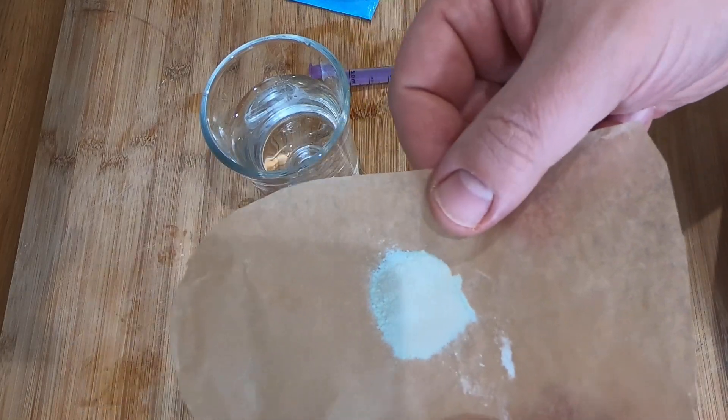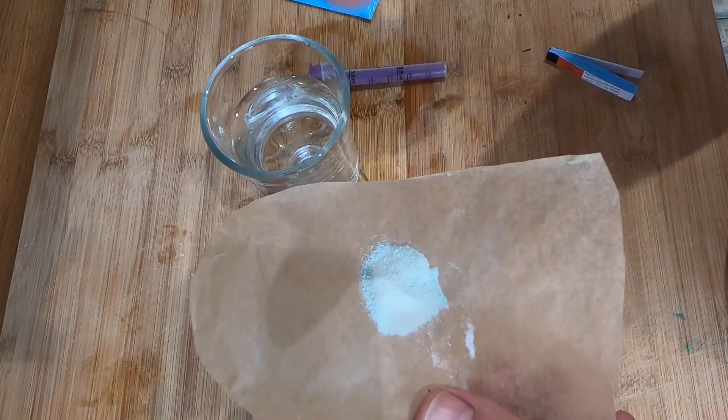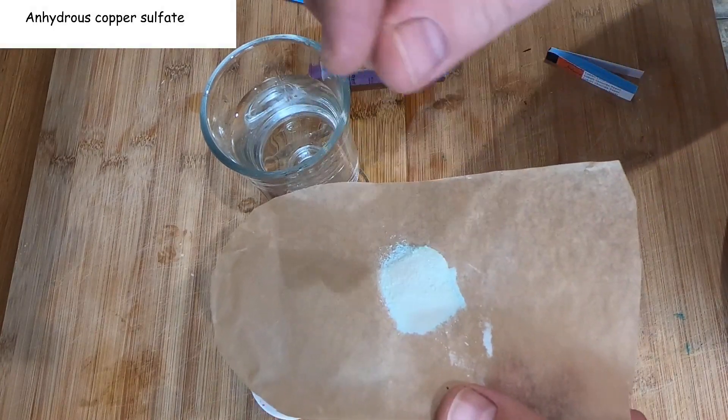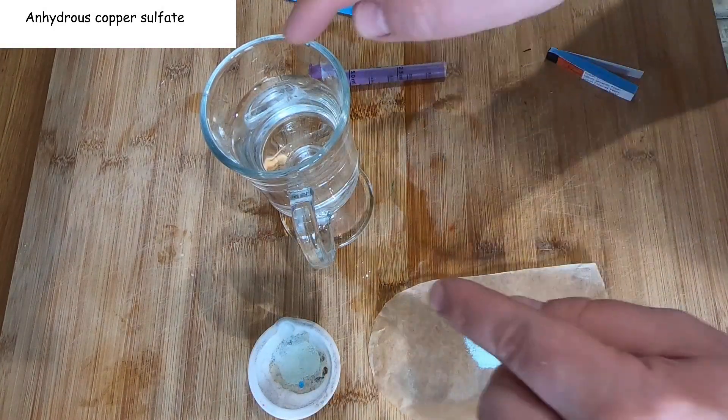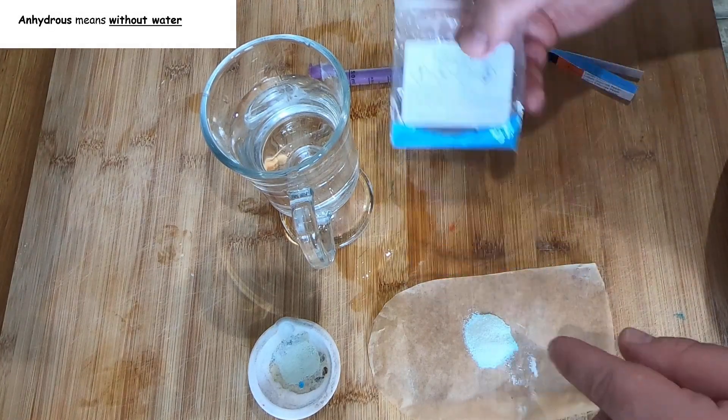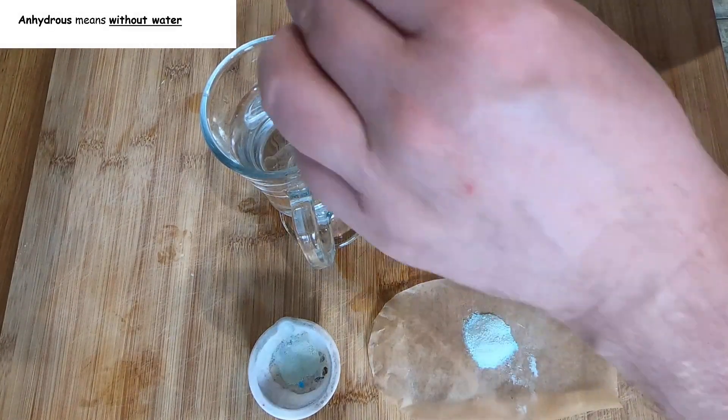Okay guys, what I have here is white anhydrous copper sulfate. Basically I took some blue copper sulfate crystals, heated them in the oven, and they became anhydrous. It gently evaporated the water.